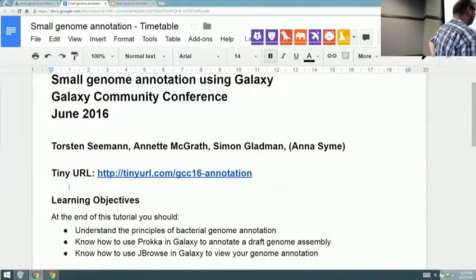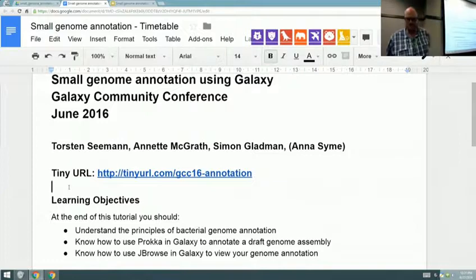All right, I don't know where Simon is, but we'll start. So, who wasn't at the genome assembly tutorial this morning? Yep. All right, that's all right. I'm quickly going to recap what we did.